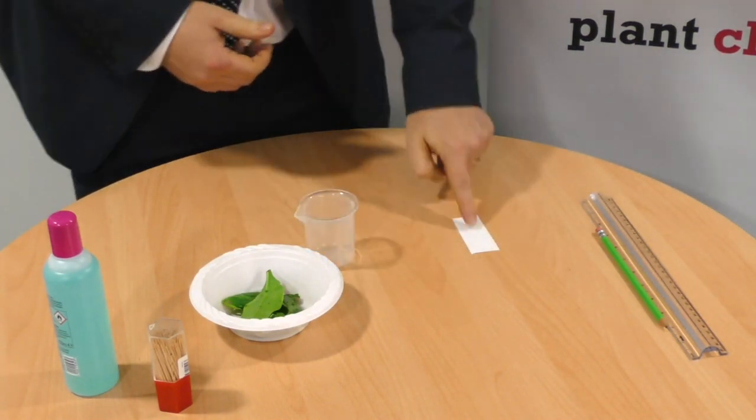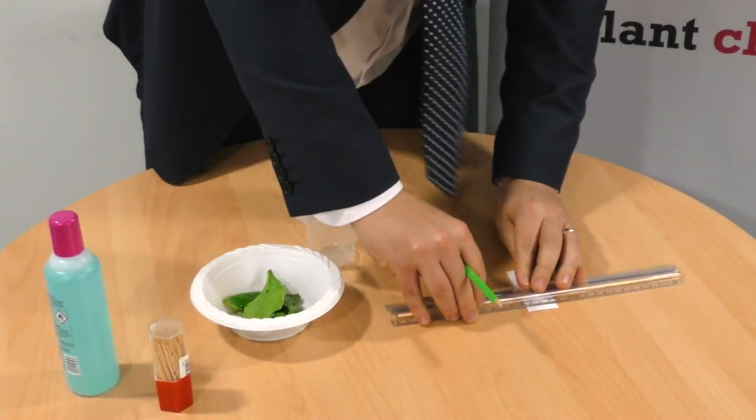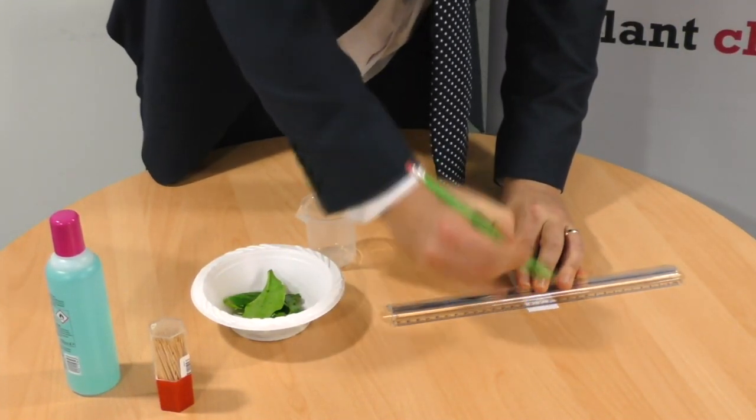Begin by taking the length of filter paper and draw a straight line near one end using your pencil and ruler across it like so.